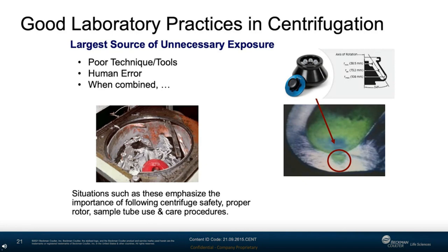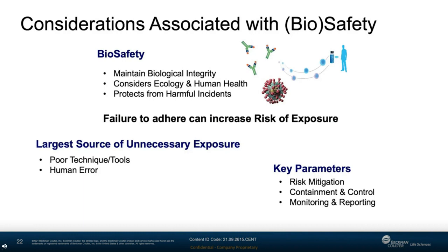In one case, the rotor was old and the lab knew there was a chance that this would happen eventually, and it did. That particular lab did a lot of ultracentrifugation, and it did not derate their rotors, but used them to failure, again, knowing at some point that the rotor would fail. Another incident that I'm aware of was due to operator error. The samples were not properly balanced, and in this case, the centrifuge was lost. And of course, the samples were lost at the same time.